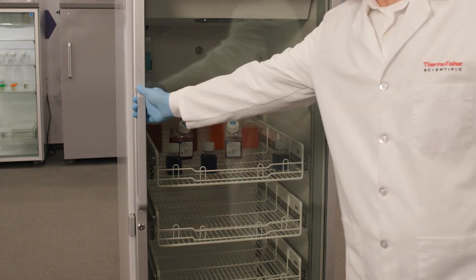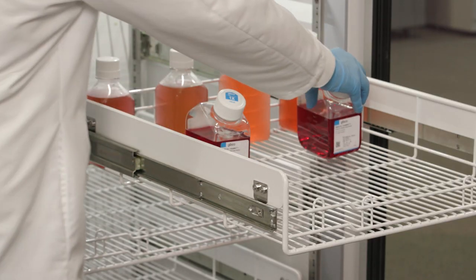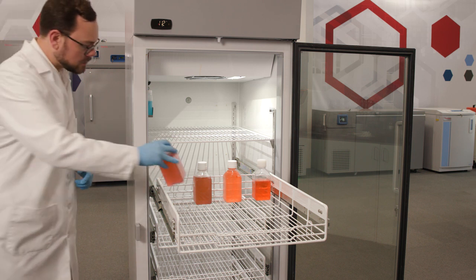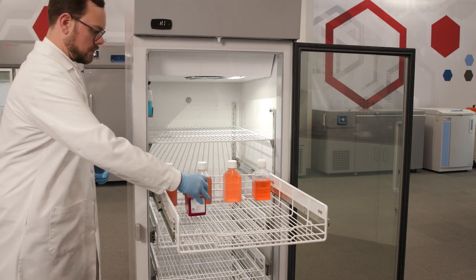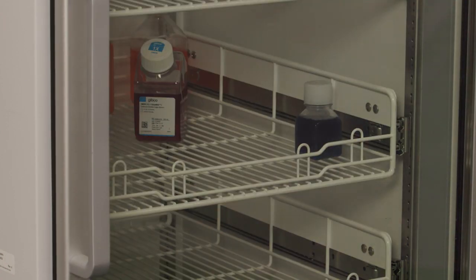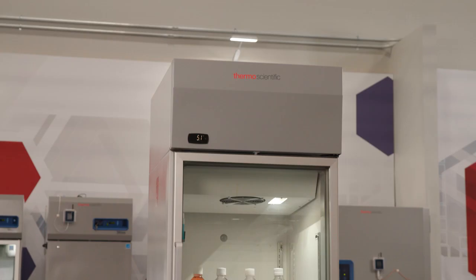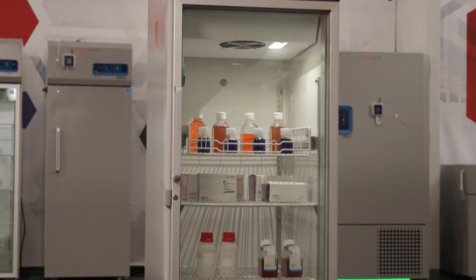Open only one basket at a time to prevent tipping the unit. Purchase additional shelves and baskets to accommodate extra weight or other storage needs. Make sure that items fit the shelf space or are contained completely within baskets to prevent the door from closing incompletely or damaging the shelves and baskets. Do not place items directly on the floor of the inner chamber.